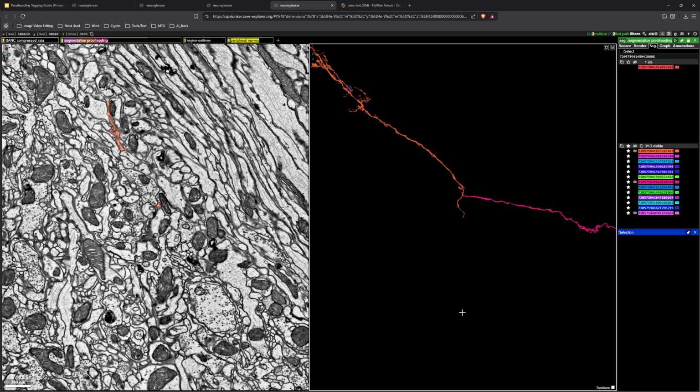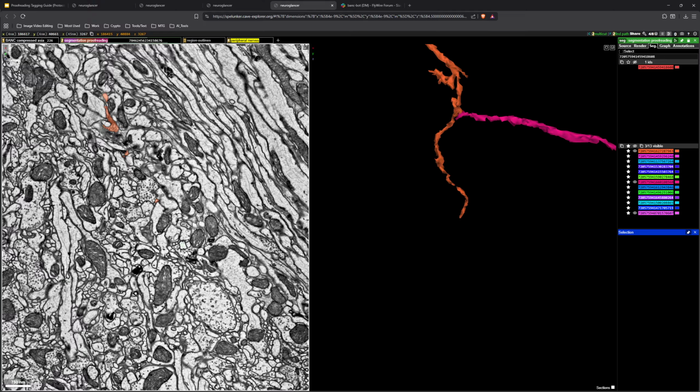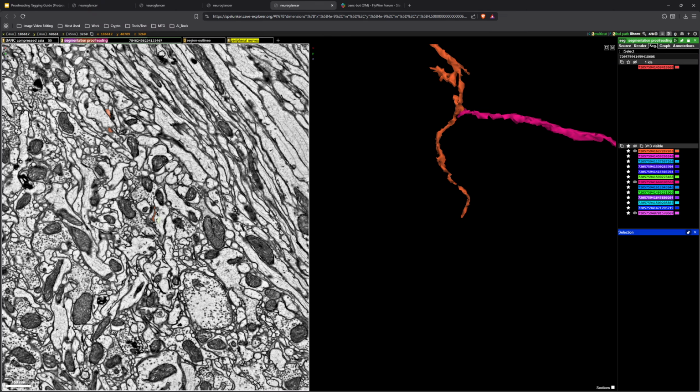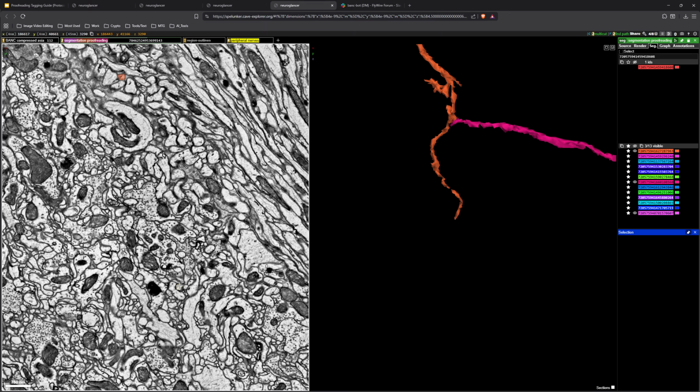The lobula plate is thinner, so there's just more area to be occupied in that direction. So if you look at a bunch of cells and take the average of the extensions from this point onward, there's more often than not more neuron over here than over here. So tracing this, I was able to find not much. It's probably some smaller connection that leads to some smaller type of bouton. So we did our best there. I think there's a little bit of a merger there, so that could be cleaned up, but it's not super important.